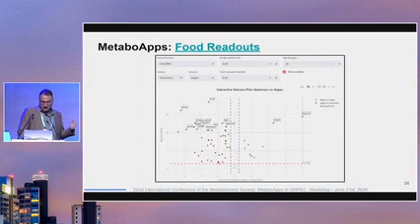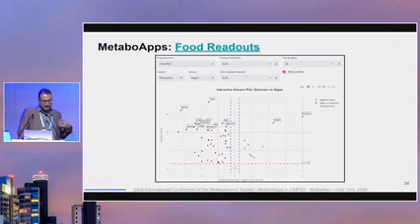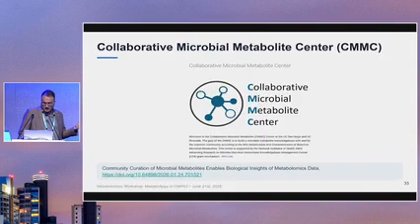And the last one is a volcano plot. Of course, you can change the thresholds, the groups, that if you have more groups on your study, you can also change that and see what are the most relevant features. It's going to also label the most significant ones. It's going to label what food they are related to, and then of course the groups that are most present.